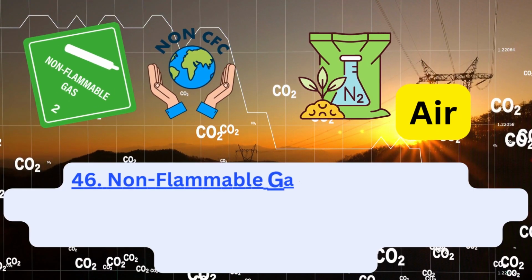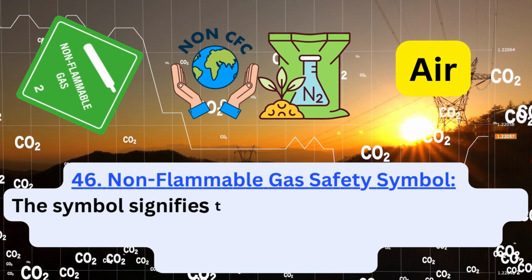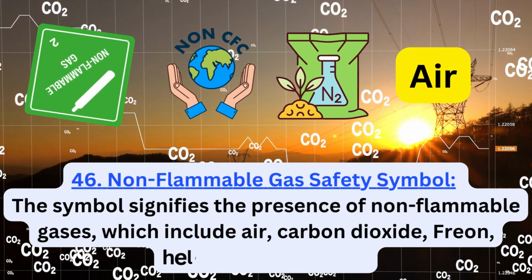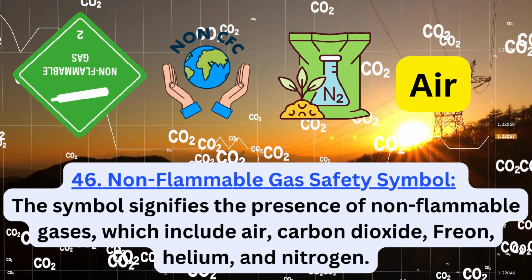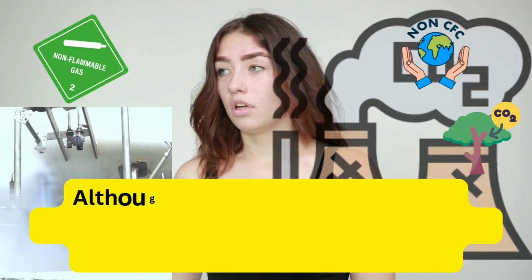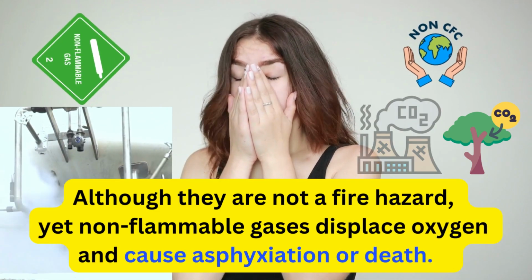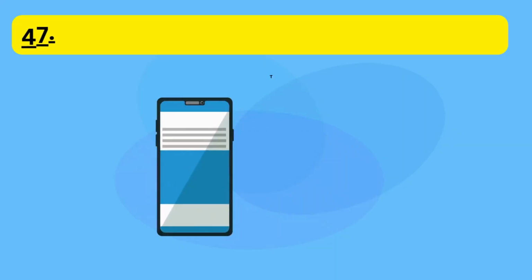46. Non-flammable gas safety symbol. The symbol signifies the presence of non-flammable gases, which include air, carbon dioxide, freon, helium, and nitrogen. Although they are not a fire hazard, non-flammable gases displace oxygen and cause asphyxiation or death.